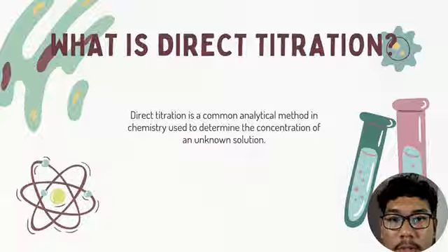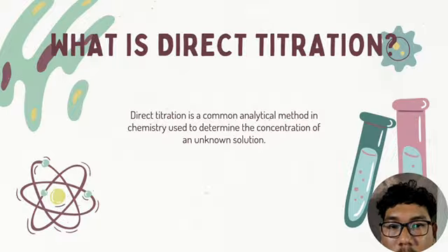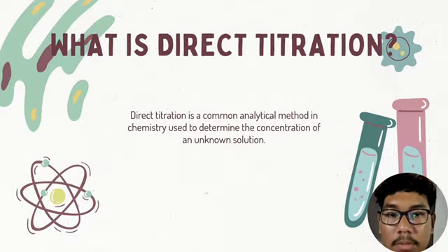The titration proceeds until the reaction is complete and reaches the equivalence point, which is typically detected by a visible change such as a color shift from the indicator or a sudden change in pH. The volume of titrant required to reach the endpoint when the indicator changes color is measured and used to calculate the concentration or amount of the analyte.